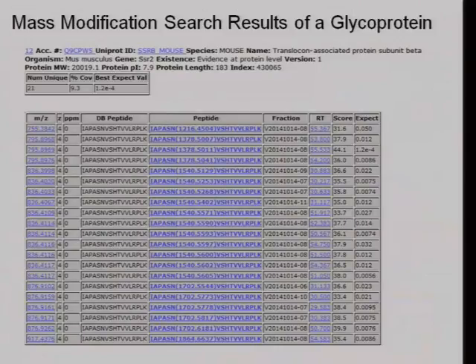But if you've got samples like this where it's mouse data where they have neuraminic acid and N-glycolyl neuraminic acid as well, then we probably should be using different names. So at the moment, in the software, SA is N-acetyl neuraminic acid, and if you want N-glycolyl neuraminic acid, you put SA-ox for an oxidized, because the mass difference is an oxygen.